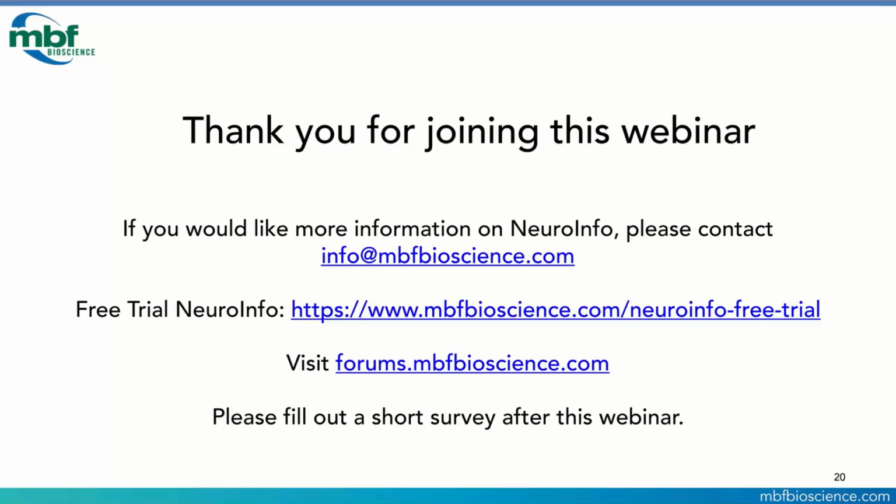Okay, great. This is Chip Gerfen. Anyway, I'm a little embarrassed having to listen to that presentation that was done some time ago. The one thing I want to emphasize is that this is a very powerful program, and I wanted to just give an overview of all the different steps. Each of those steps would require a lot of detail to teach how to do it, and we'll be providing follow-up webinars to provide that detail.